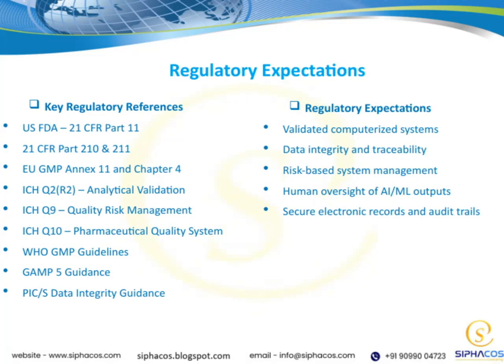Let's take a closer look at the regulatory expectations that guide our work in this field. First, when it comes to validated computerized systems, it's essential that these systems are thoroughly tested and validated to ensure they perform reliably and accurately. Data integrity and traceability are also critical. We need to ensure that all data is accurate, complete, and can be traced back to its origin, which helps maintain trust and accountability.